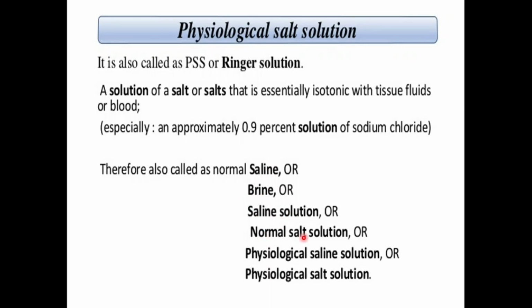Saline solution, normal salt solution, physiological saline solution, or physiological salt solution. So these liquid mediums have many names. They can be called by any name, and any name corresponds to the physiological salt solution. So if any name comes, if you read any name among these, it should come to your mind that this is the solution in which you have placed your animal tissue, the muscle which you want to study outside the living body.